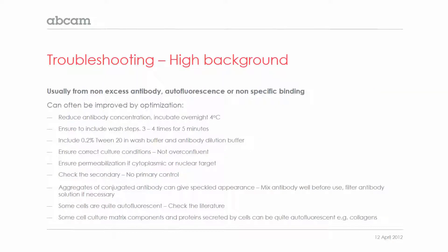Moving on to high background: if you have high background, it's usually from excess antibody, autofluorescence, or nonspecific binding. For this, you need to do the opposite — reduce the antibody concentration. Make sure you're incubating overnight at four degrees. Ensure that you're including wash steps: wash three to four times for five minutes at each step, and make sure you include a mild detergent like 0.2% Tween in the wash buffer and antibody dilution buffer.